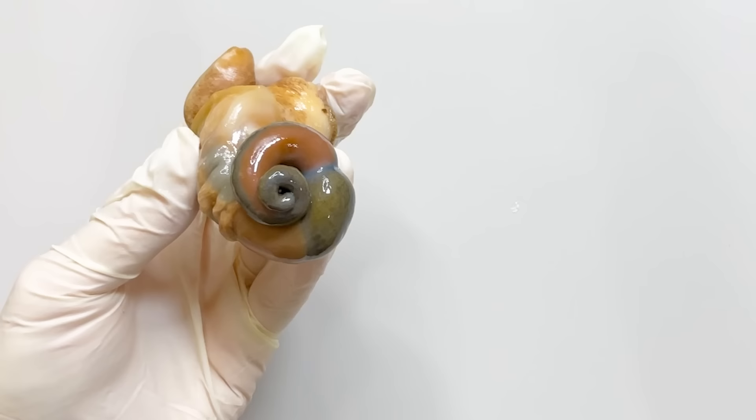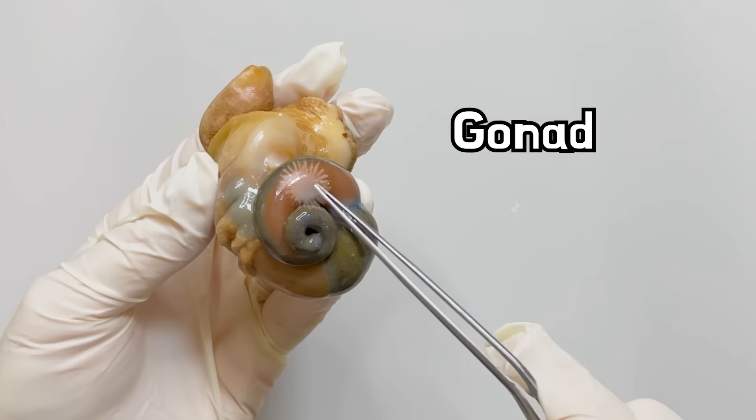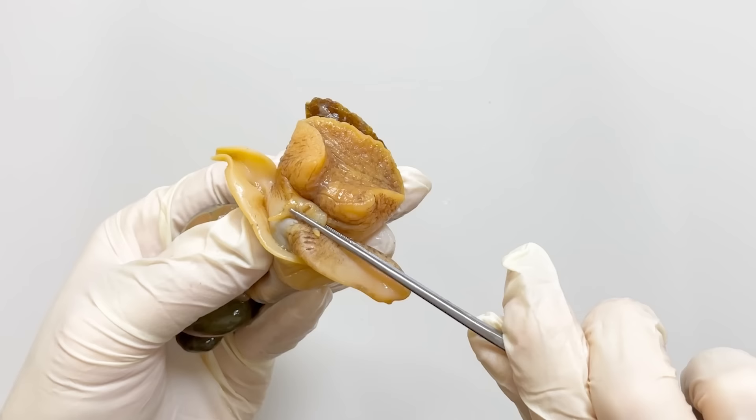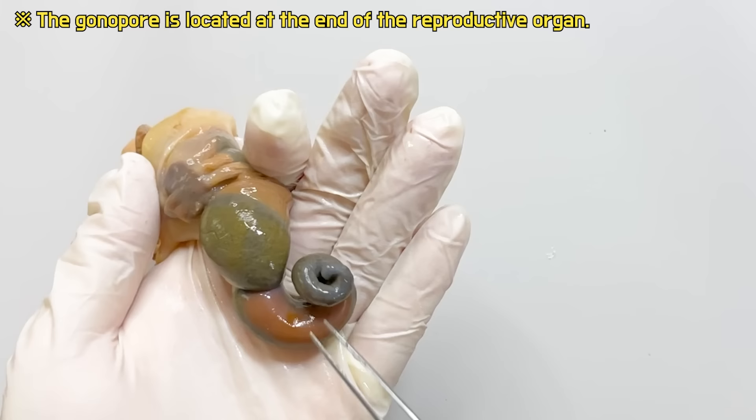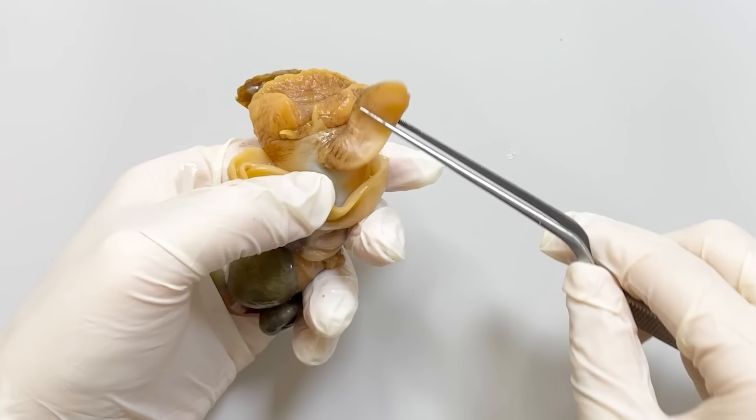Firstly, the brown striped part here is the gonad, located at the very top. This whelk is a male. The bump on the right side of the head is its reproductive organ. The vas deferens connects the testis to the end of the reproductive organ, allowing the sperm to be expelled outside.